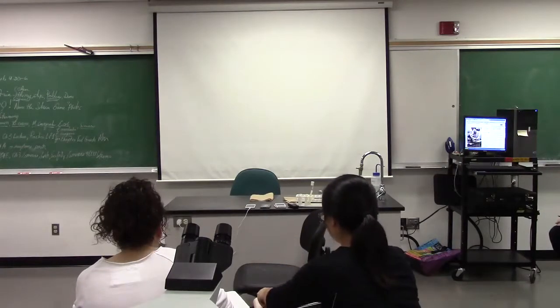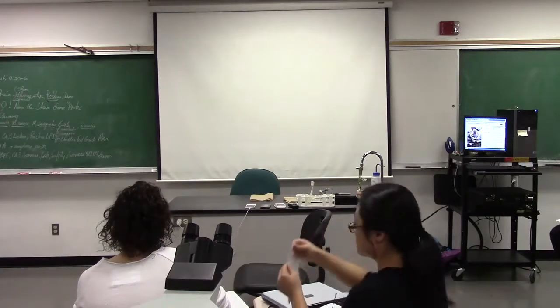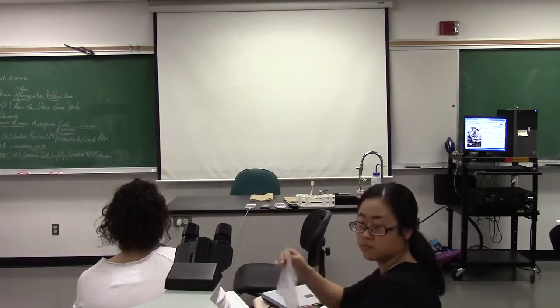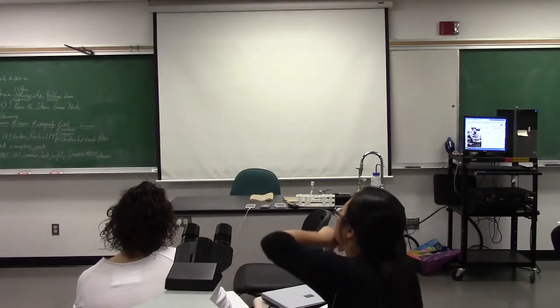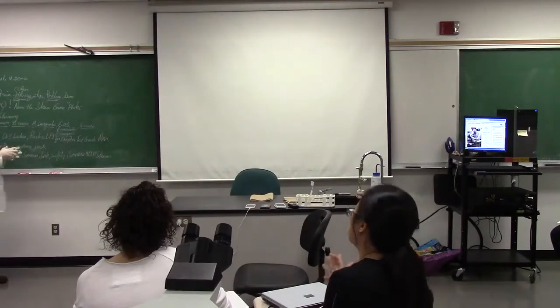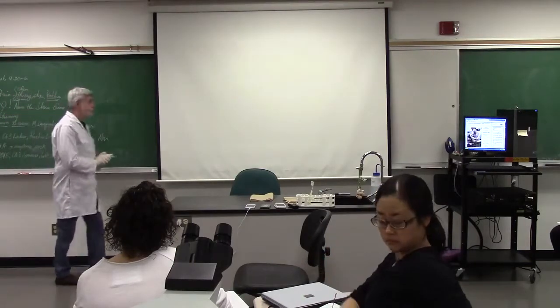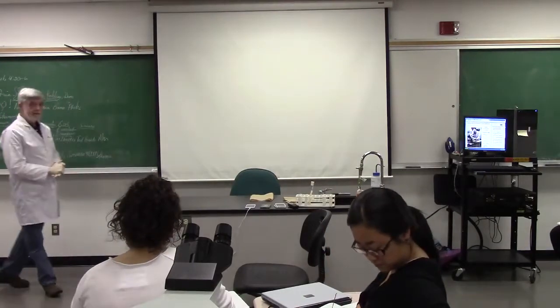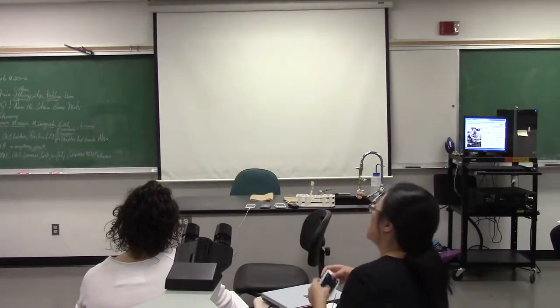All right. So we're going to go over the agenda. There was a practice of acid fast gram stain from 4:30 to 6, and it's now almost 7 minutes past. We're going to go over everything about the endospore stain: the chemistry, the theory, the genera that stain positive on it, the steps, the problems, and the demo. And just to be weird and sick and twisted, I'm going to start with the demo today.